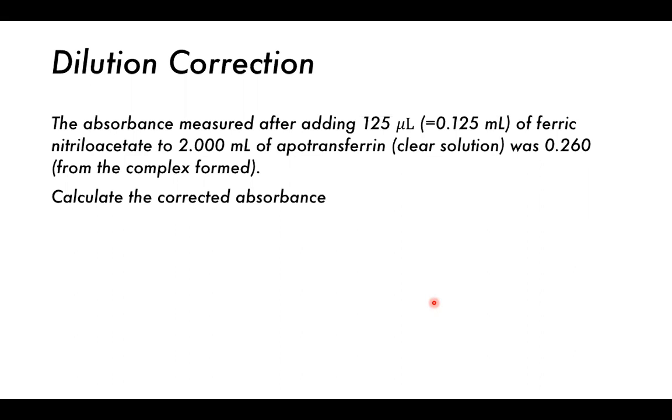Remember, we've diluted our solution here so that we could get an absorbance of less than 1, which would usually be within the linear range. Usually you'd want your absorbance to be less than 1. At the very most, it should definitely be less than 2. Absorbances greater than 1 are usually suspect. So you want the absorbance to be somewhere between 0.1 and about 0.8 or 0.9.